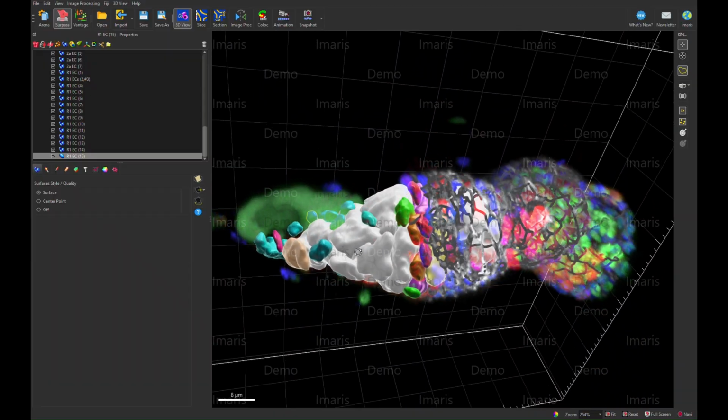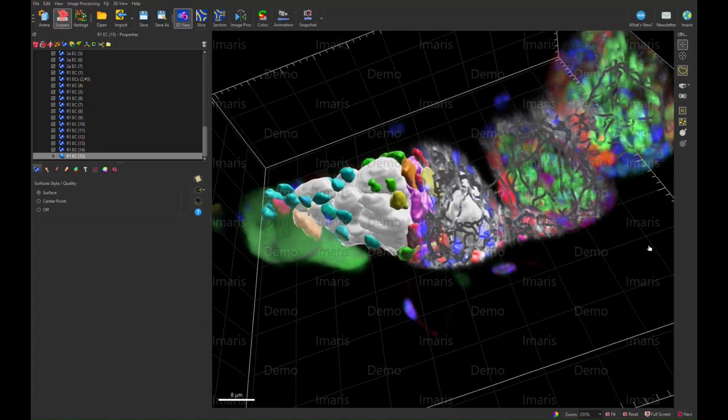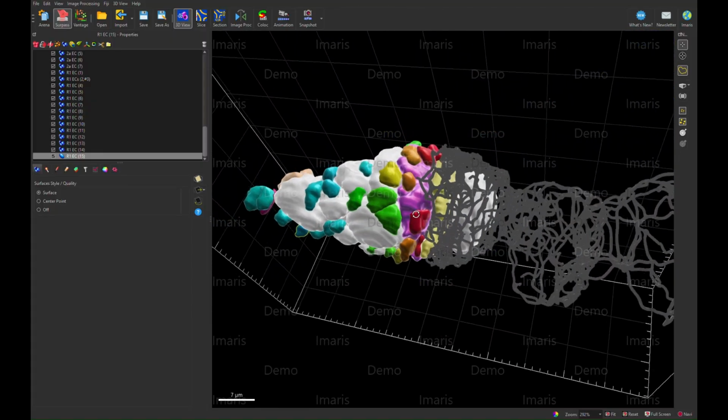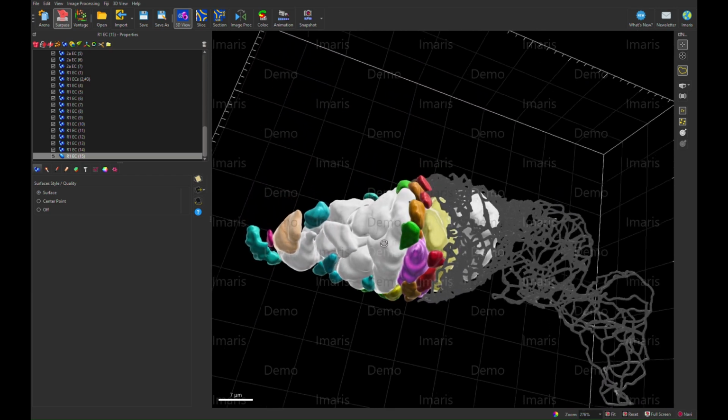That's kind of the entire composition of our germarium. I'm just turning off some of these channels now so you can just see these volumetric reconstructions of the fluorescence that I was able to trace from those two-dimensional images.